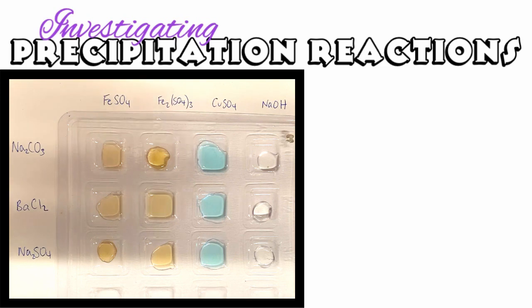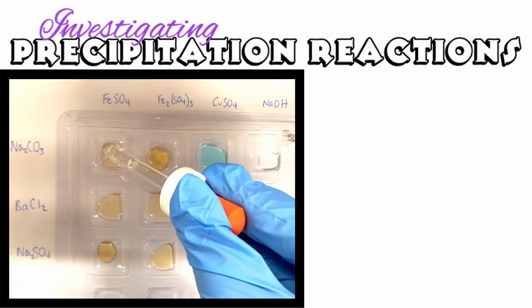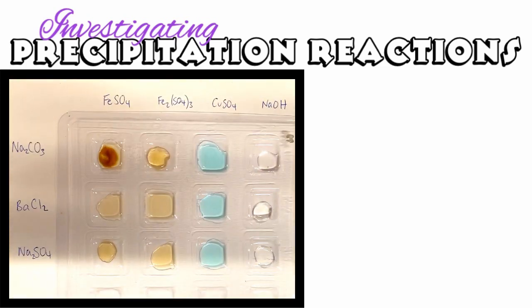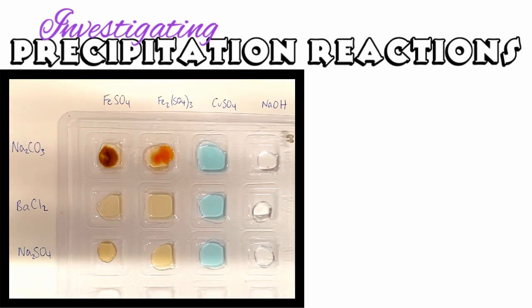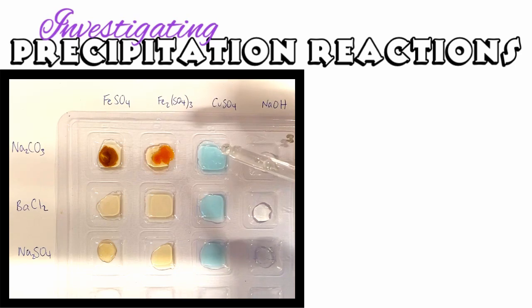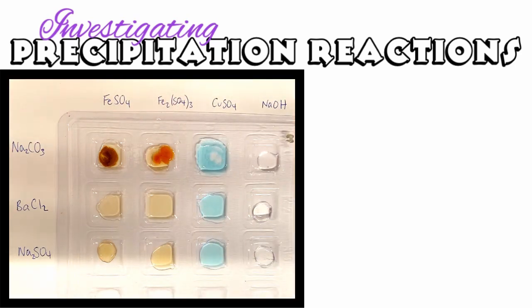There's actually a little mistake a bit later, and I thought about editing it out, but I've decided I'm going to leave it in and use it as a learning opportunity. See if you can see it, and I'll point it out later in the video, but one of these reactions forms a precipitate and it shouldn't. See if you can pick which one it is.